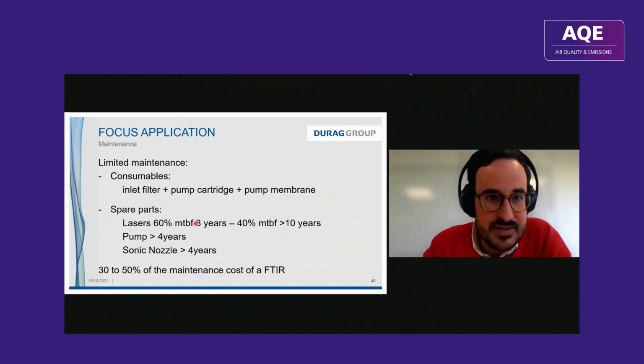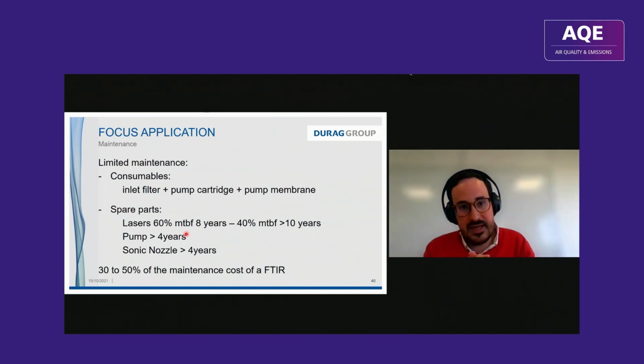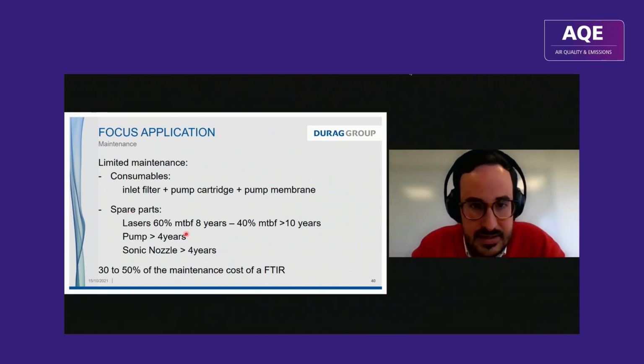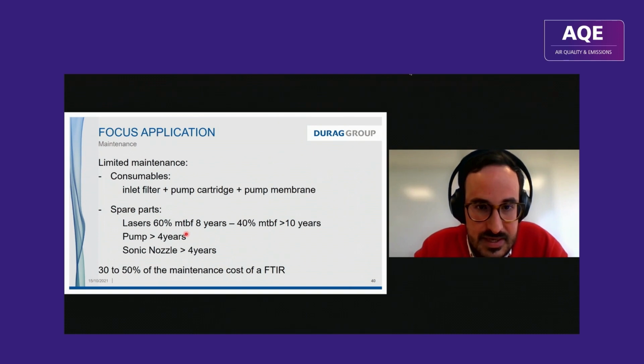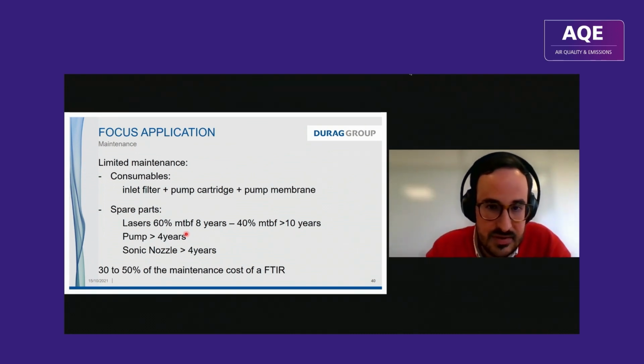So about the maintenance for emission, as I told you, there is a limited need of maintenance. The main consumables will be the inlet filters, the pump cartridge, and the pump membrane. We use lasers, most of them used in telecommunication, so their lifetime MTBF is between 8 to 10 years. Our pumps are given by our German manufacturer for more than 4 years. And the sonic nozzle is a steel tubing, so it's quite resistant also.